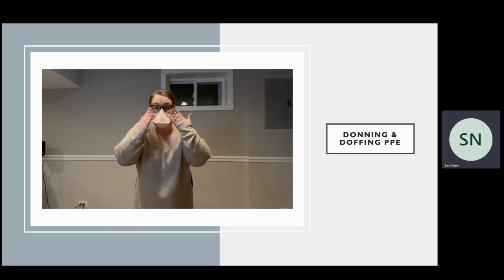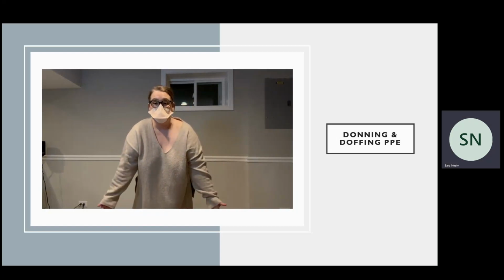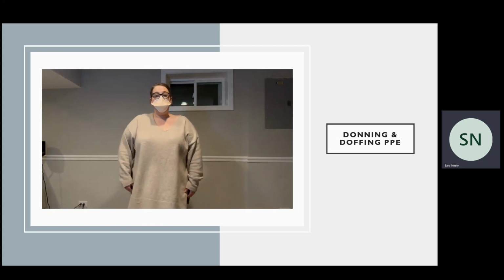Also, if you have glasses like me, you don't even need to use your hands. You can just sharply exhale and see if your glasses fogged up. If they did not, you have a good seal.